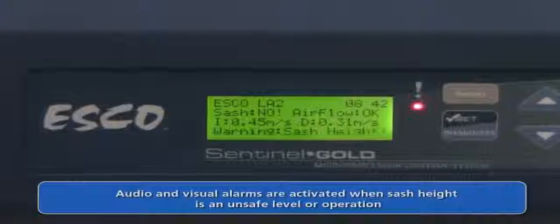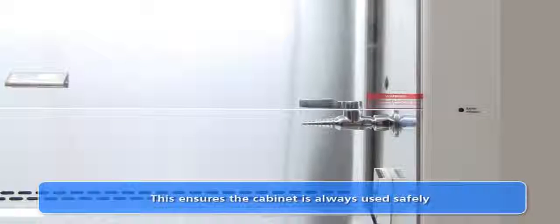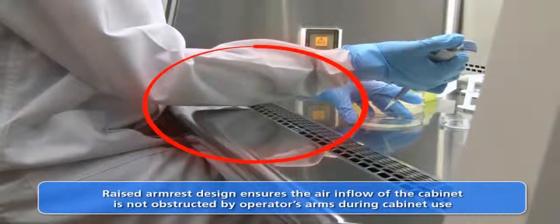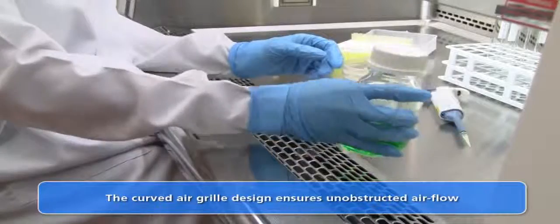Audible and visual alarms alert the user to the existence of unsafe conditions, such as when the sliding sash is at an unsafe opening height which may cause airflow disturbances. The stainless steel armrest is raised above the work surface, which ensures that the operator does not block the inflow grills while working in the cabinet. The air inflow grill design is curved to prevent objects from causing disturbances to the air intake.